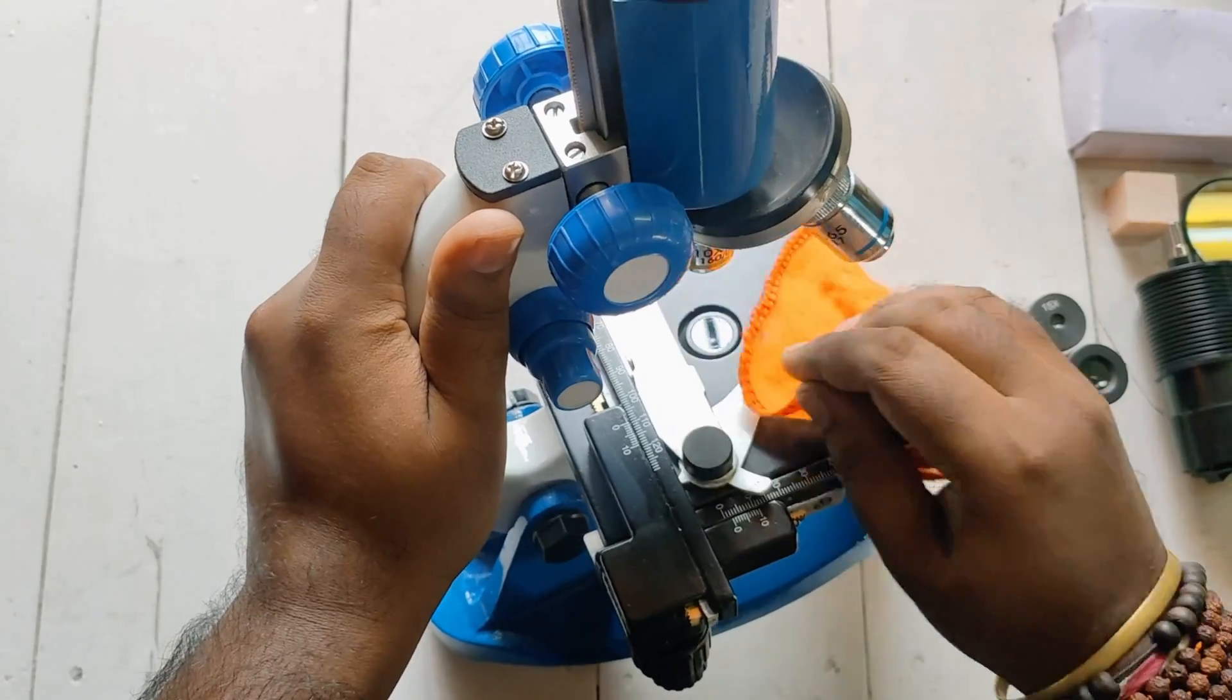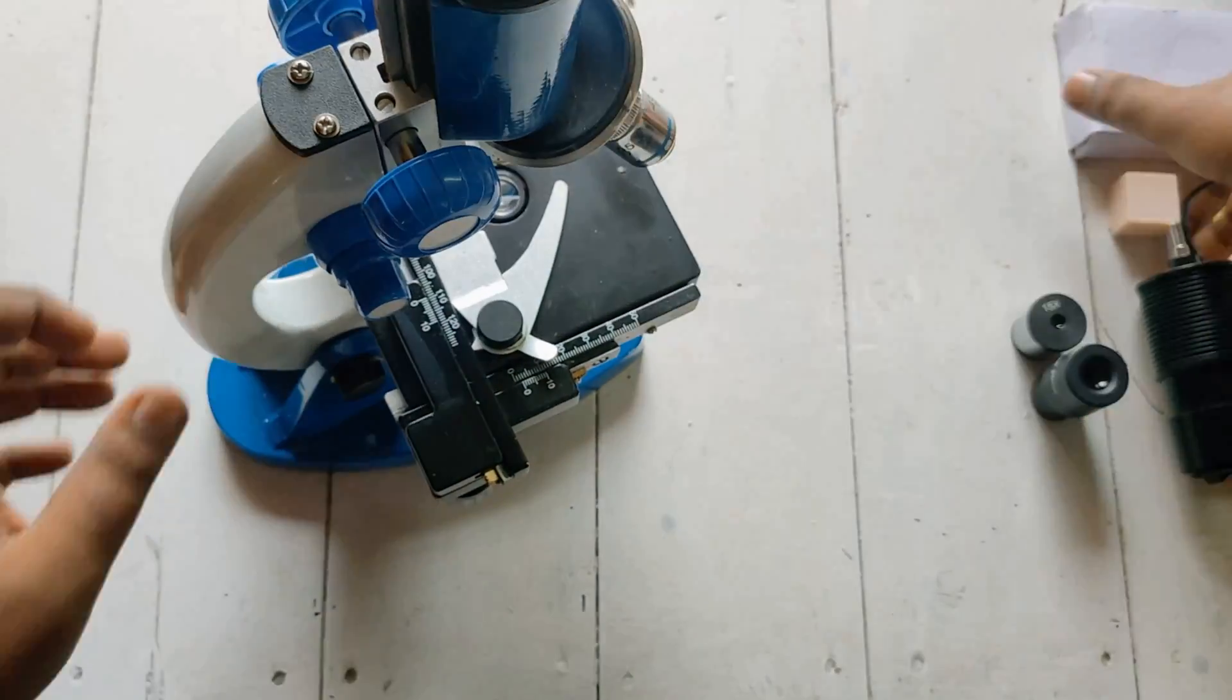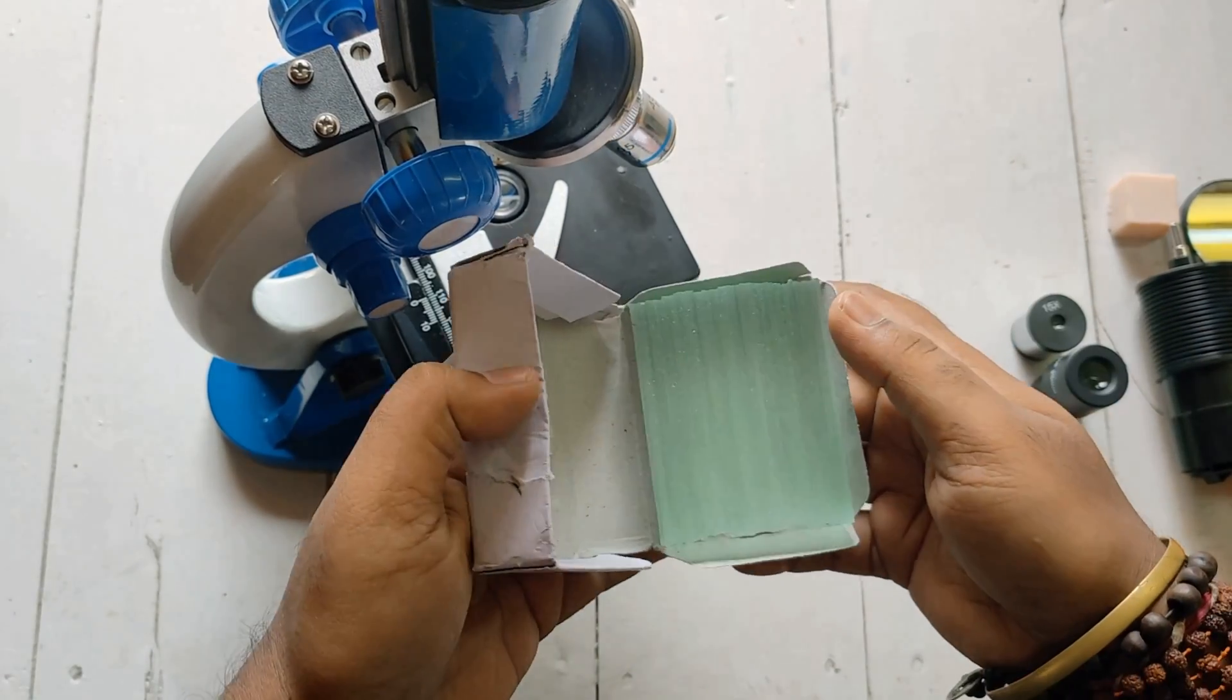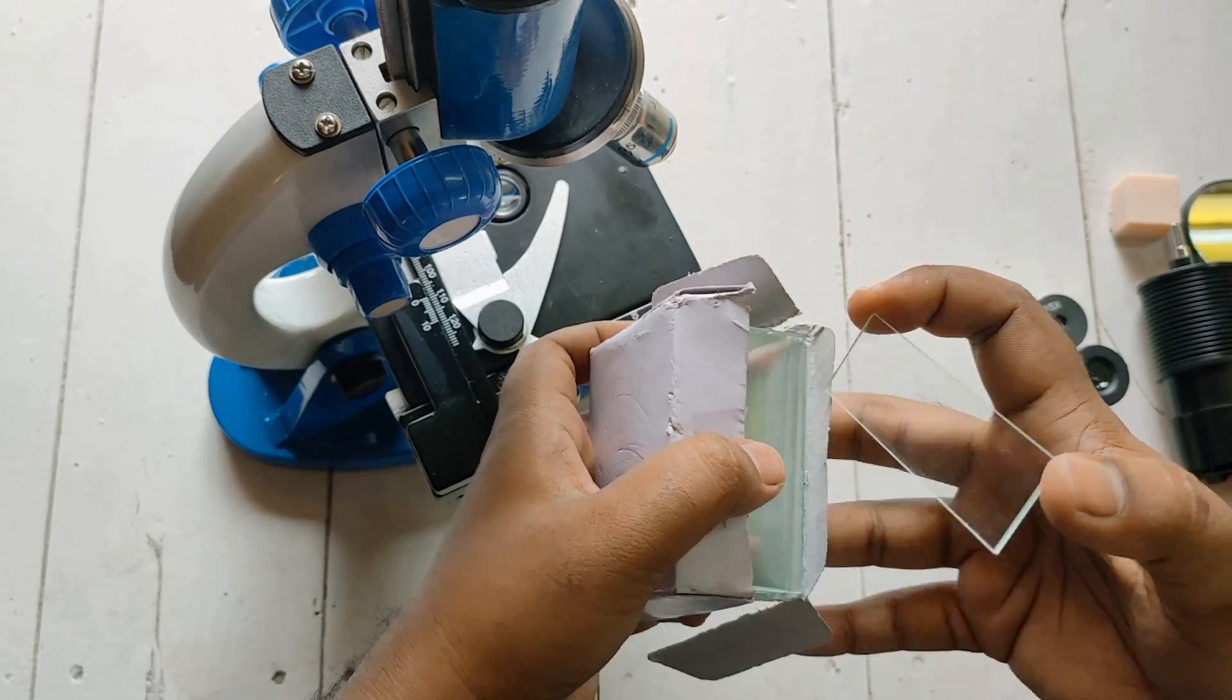I had a dream to have a microscope like this and watch the microscopic world through it. Anand Traders completely fulfilled this desire. You can get 50 glass slides with this kit, by which you can create a variety range of slides.